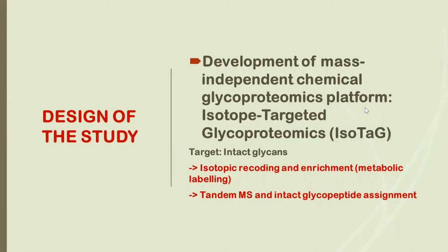So our study design uses the platform isotope-targeted glycoproteomics to do the isotopic recoding and enrichment, and then do the tandem MS and intact glycopeptide assignments.